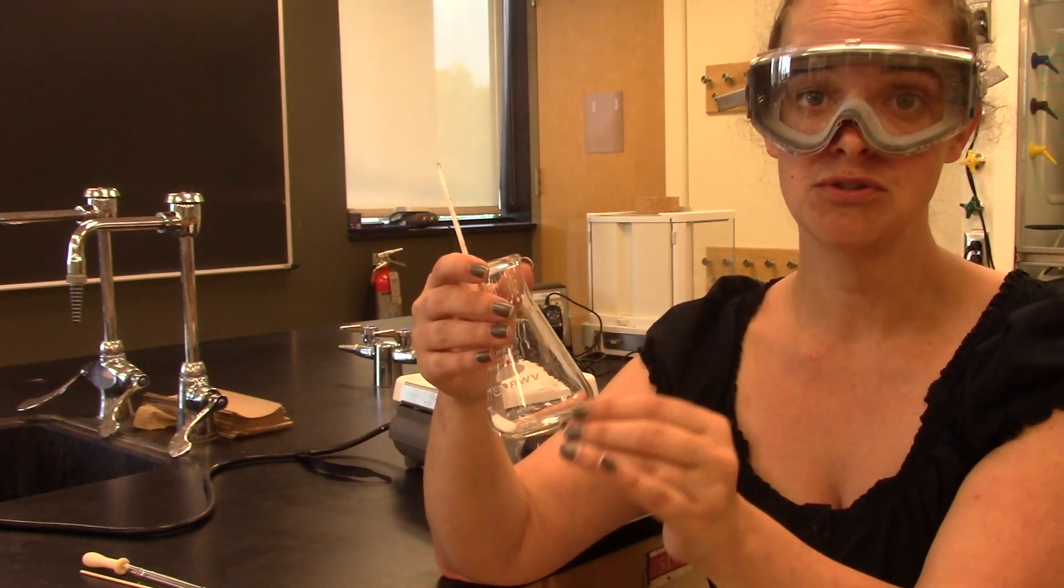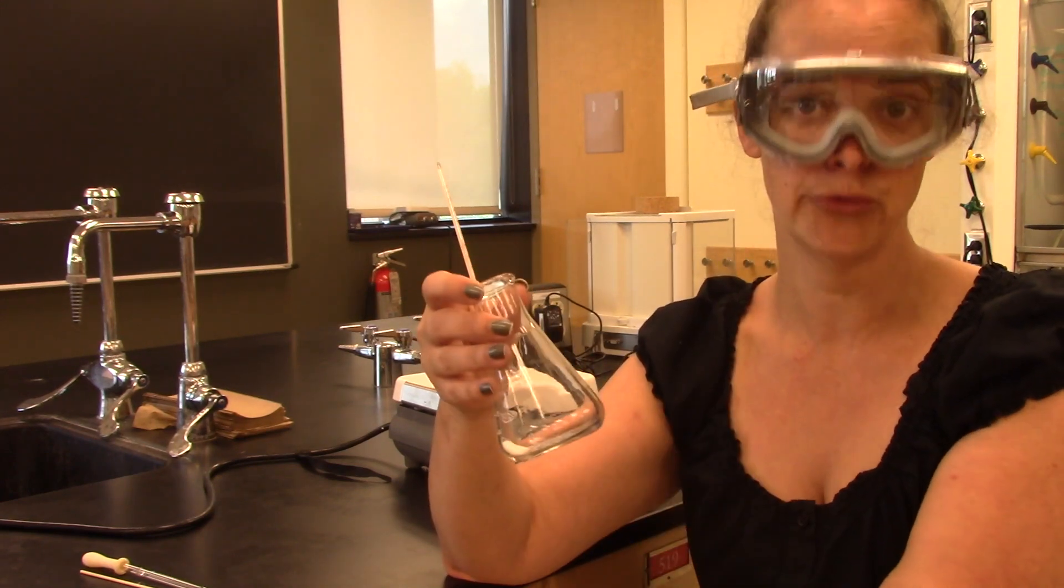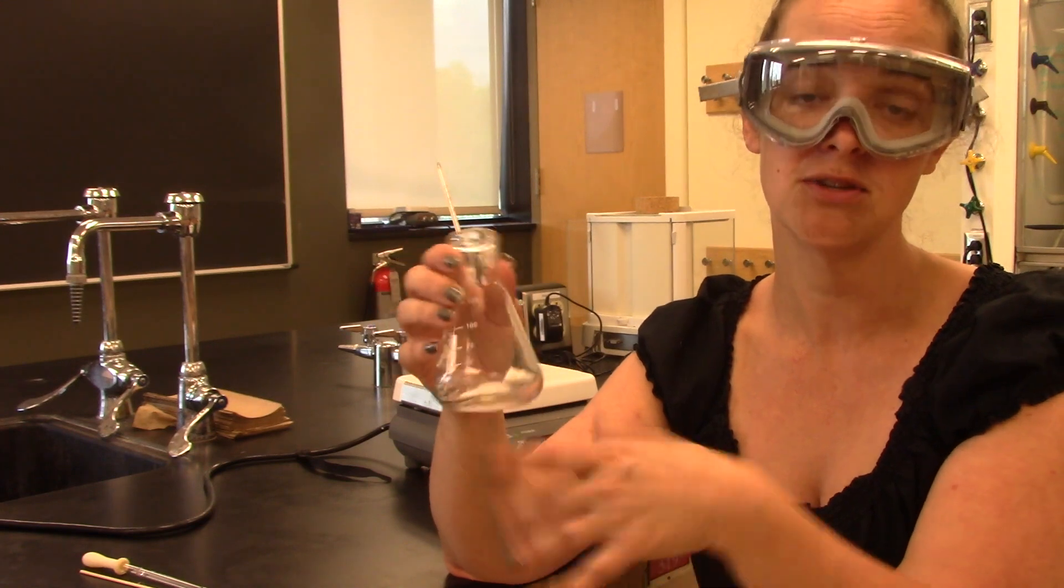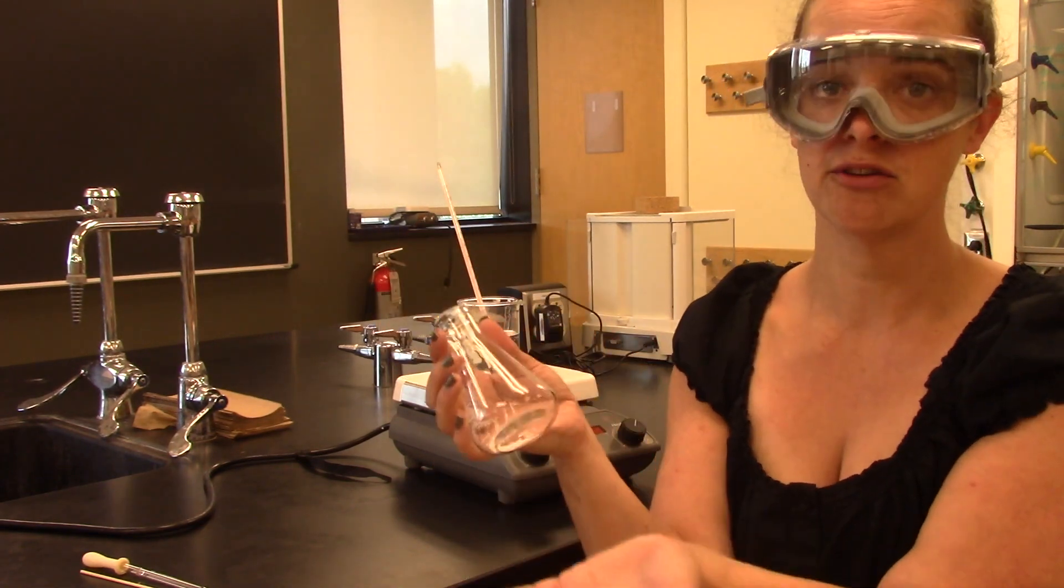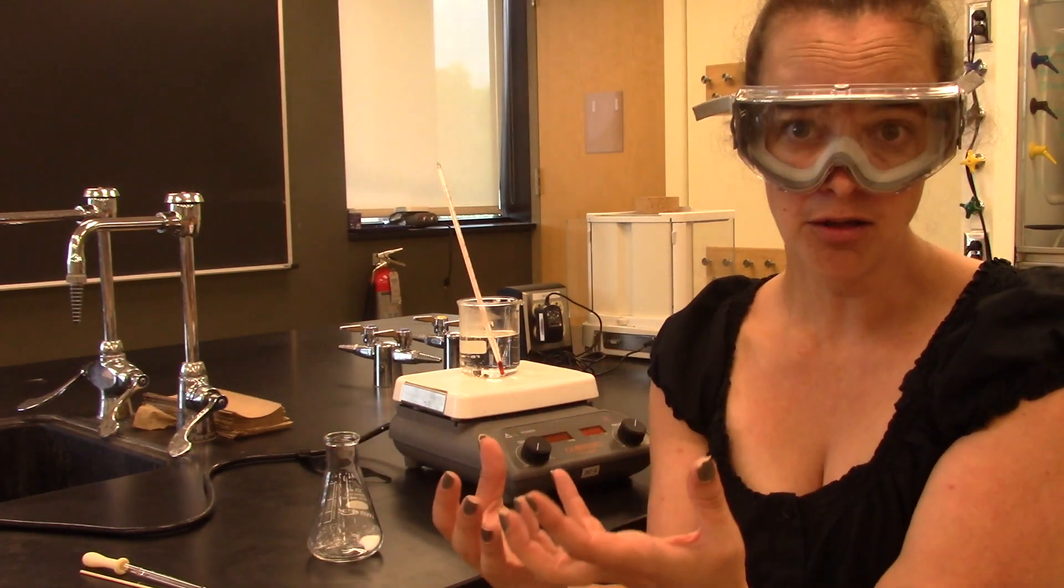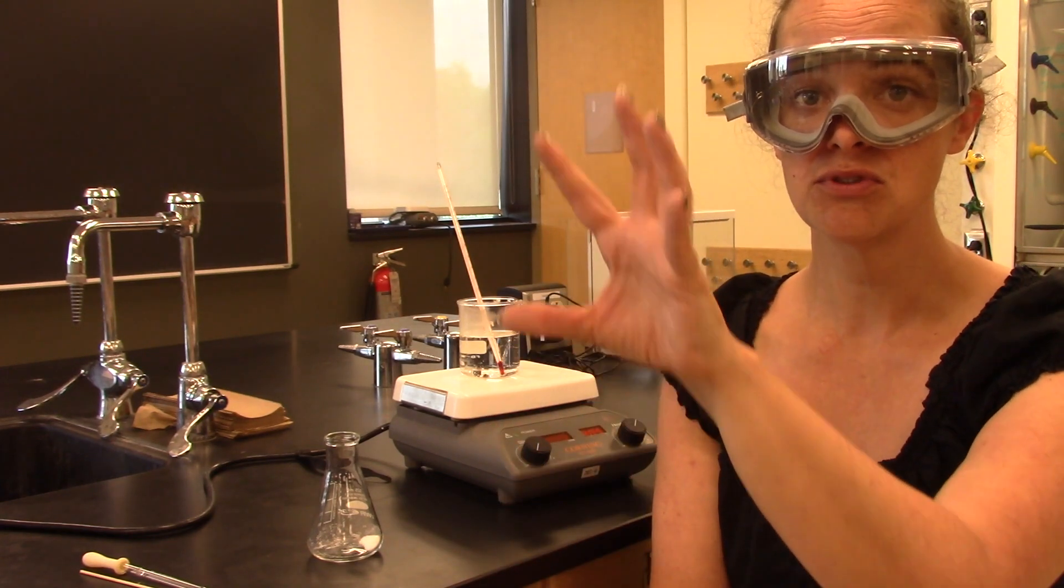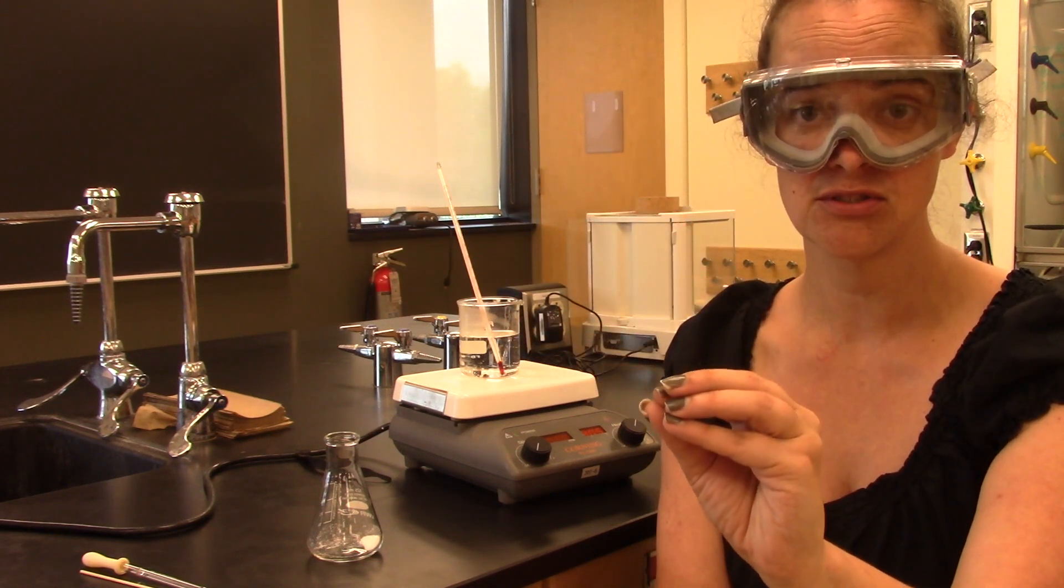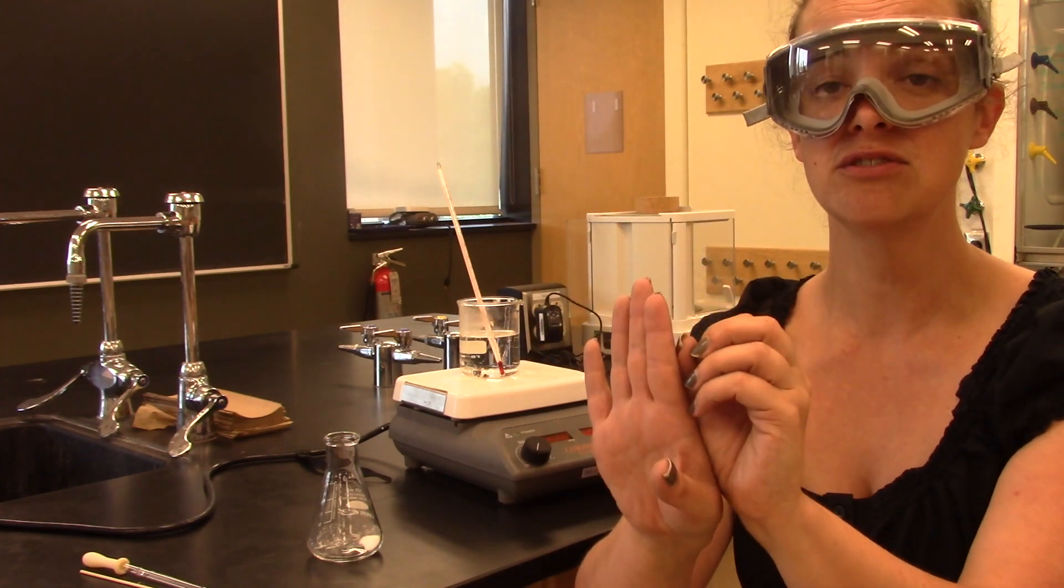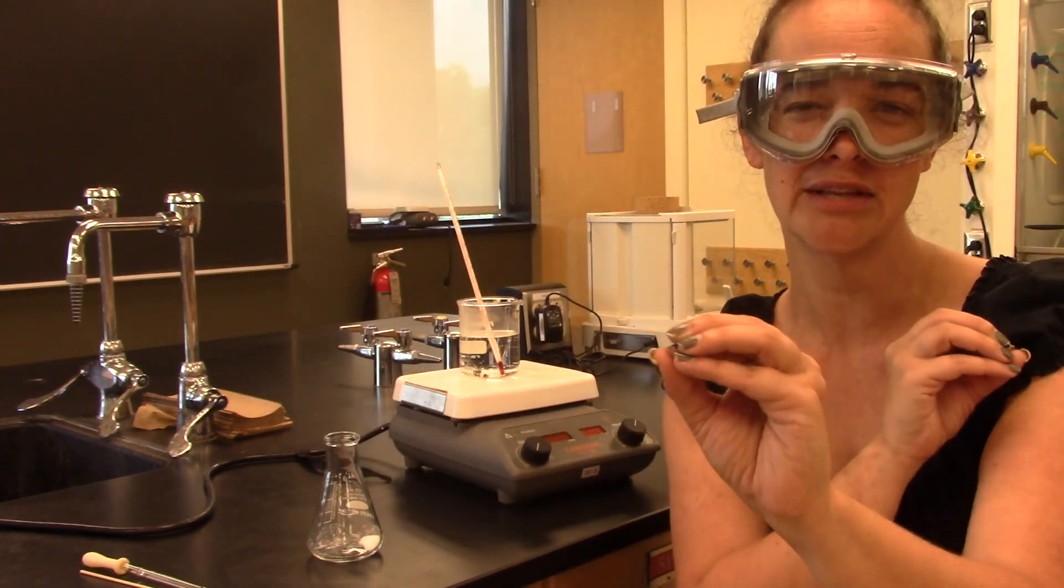The slower you do this process, the finer the phthalic acid crystals will be, or the crystals of whatever it is you're trying to recrystallize, and the purer your crystals will be. Because what we're doing is we're relying on a principle called exclusion. And that principle states that when you have a mixture of compounds and you're recrystallizing one of them, when the molecules are forming their solid network, the crystalline structure, if you do it slowly enough, any impurities that are floating around in the solution are going to basically be pushed away.